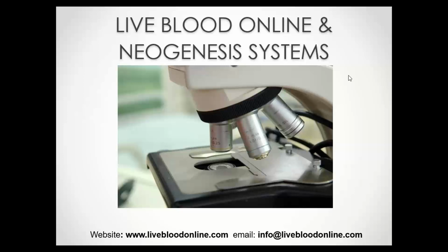However, it does still have some value in a conventional medical practice because we are looking at blood. There are signs that will appear in the sample as a result of specific diseases and disease processes. So there are some indicators that can be associated with particular diseases. We do cover this in the course, how the sample may be affected by certain diseases. And this then also depends on your scope of practice. If you're able to diagnose, then there are indicators that you can use in the blood to narrow down the list of conventional investigations that may be needed in a case to make a diagnosis.